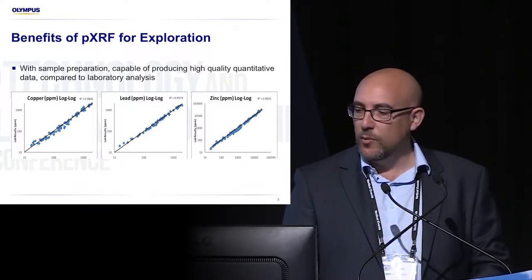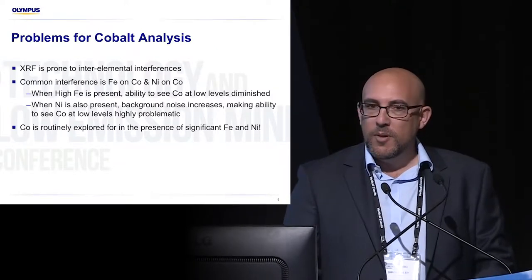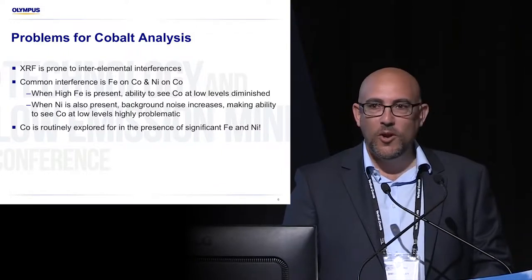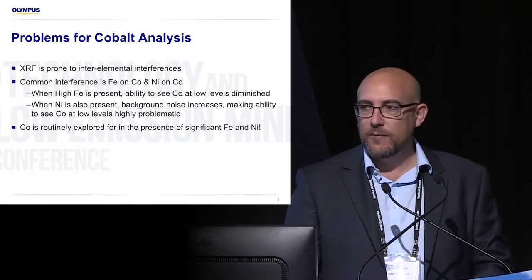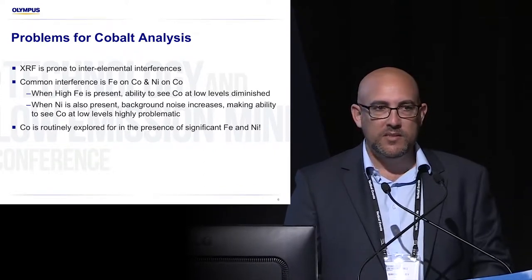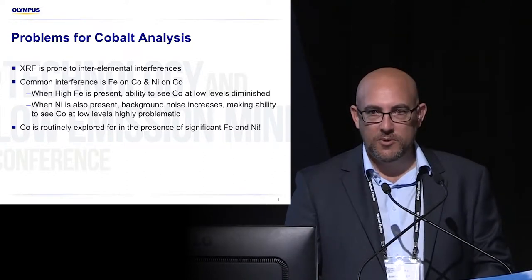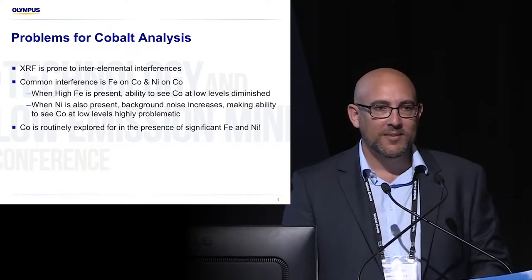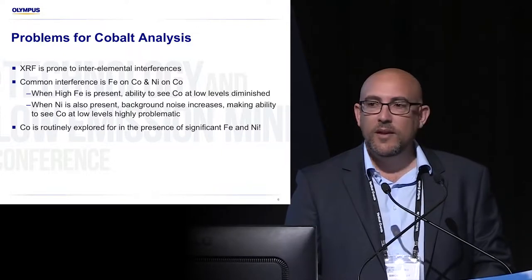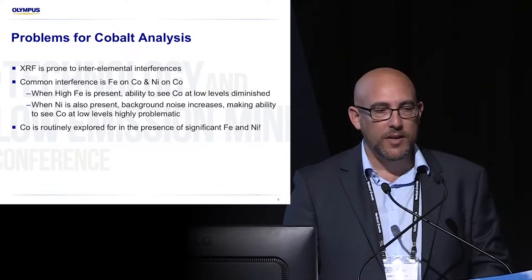It correlates very well on your base metals. But for cobalt we all know that there's a problem analysing cobalt. The problem that handheld XRF has for cobalt is it sees it nicely, but if there's a couple of naughty elements present it becomes very hard to see it. Those two elements are iron and nickel, and unfortunately you explore for cobalt in a lot of situations where there is a lot of iron and a lot of nickel.